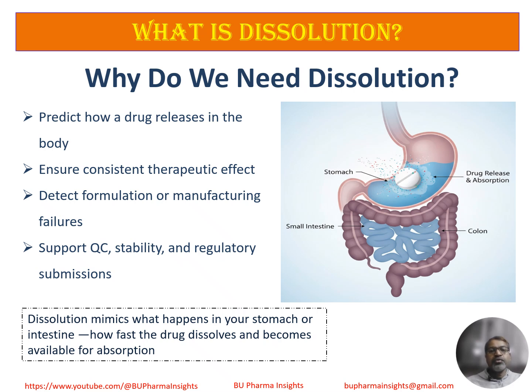Now, why do we need dissolution? Whenever you swallow a tablet or a capsule, the first thing it must do is release the drug. Dissolution testing tells us how fast and how completely the drug comes out of the dosage form inside the body.